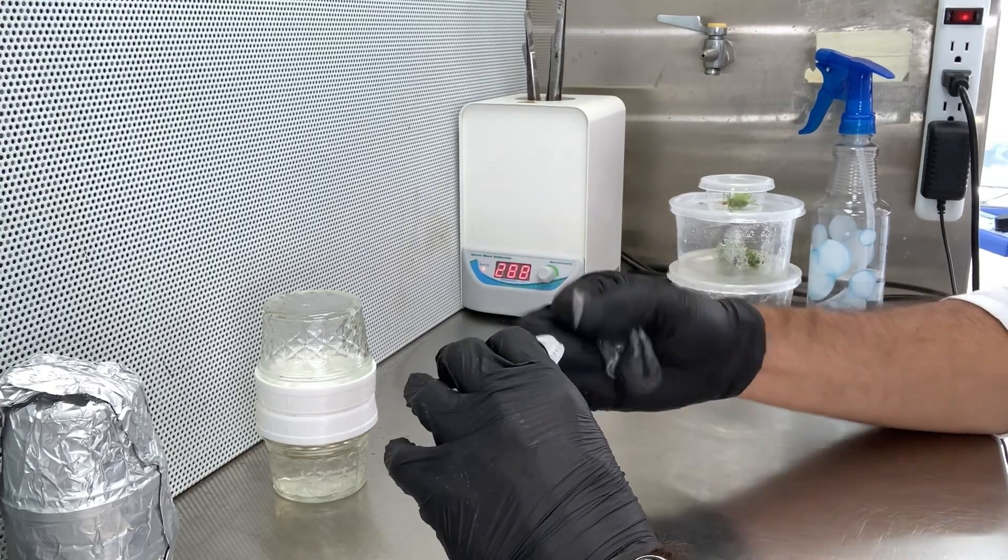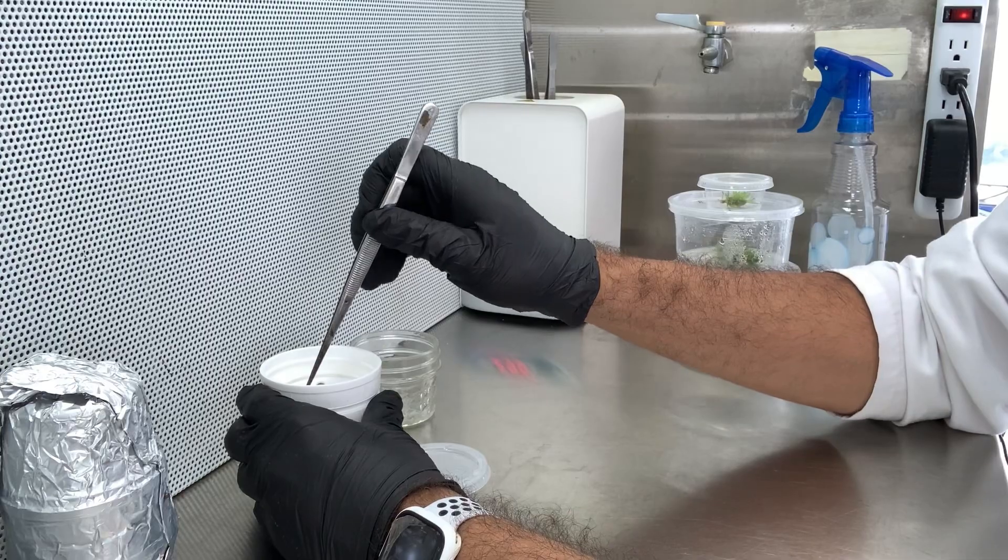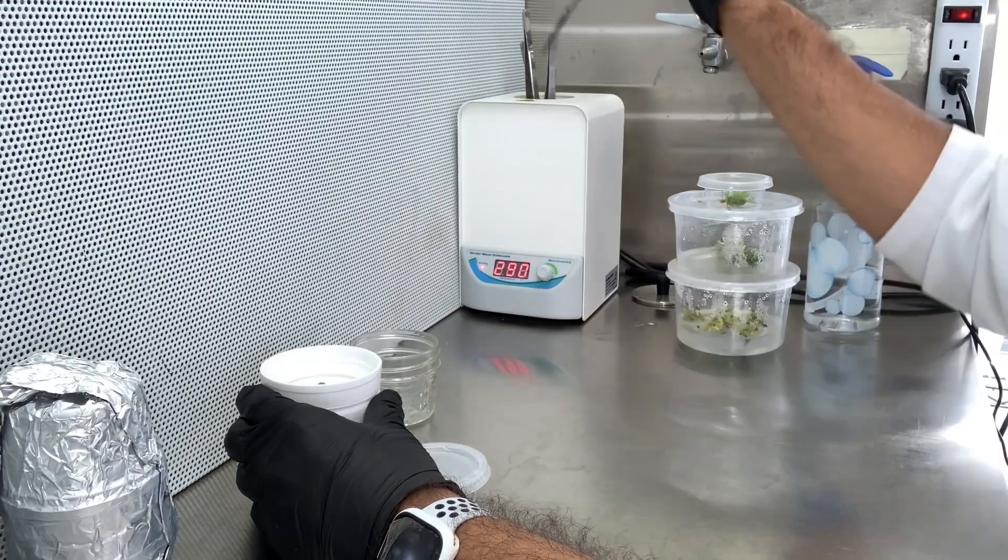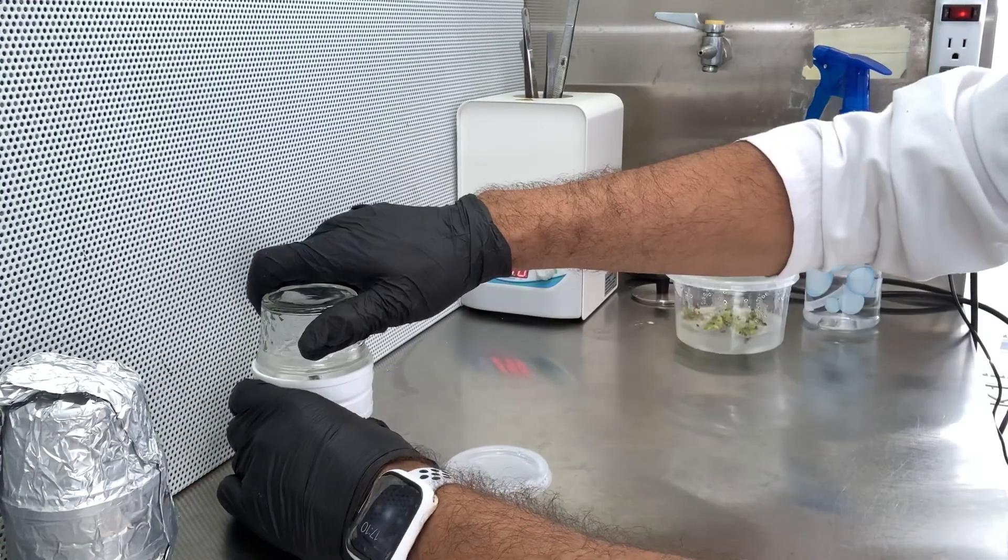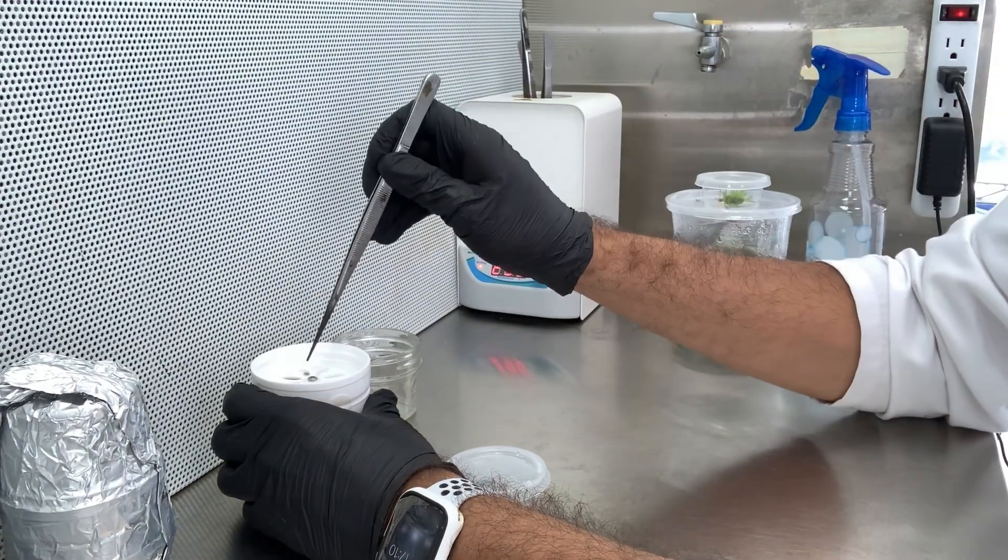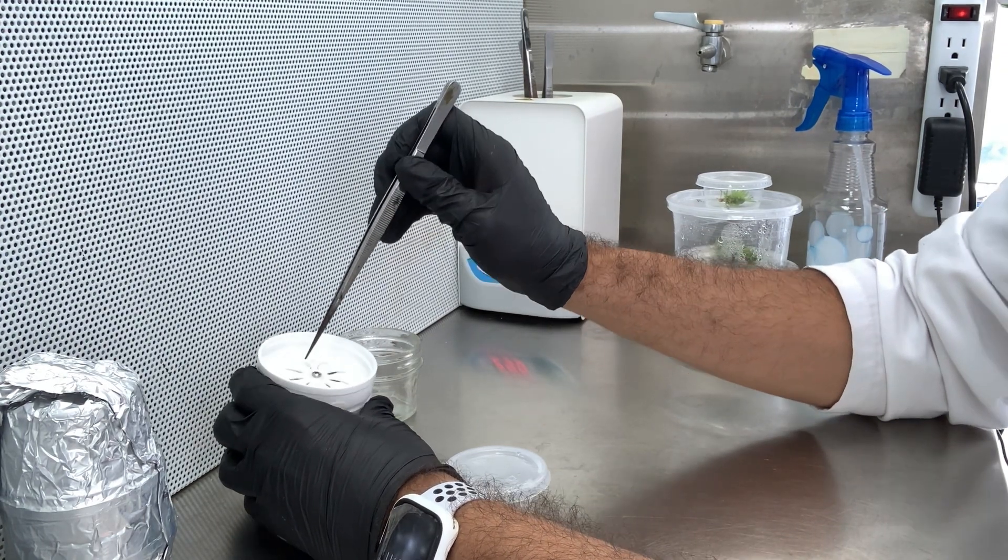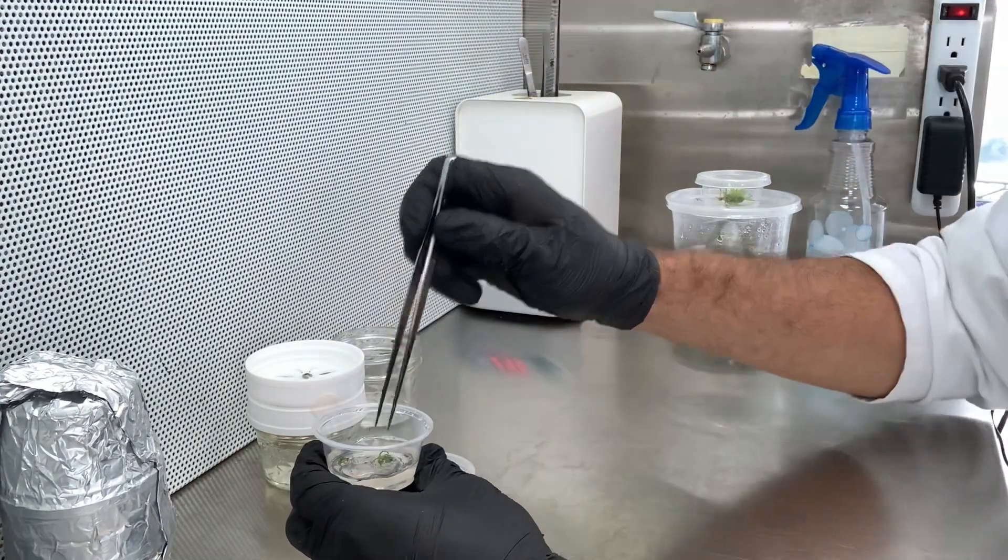We finally have a temporary immersion bioreactor that takes up little shelf space in the grow room and is easy to use and handle. The hefty 32 oz, just under one liter for North American viewers, can hold hundreds of plants. The biocoupler Temporary Immersion Bioreactor is heat resistant and can be autoclaved at 120 degrees Celsius for 20 minutes.